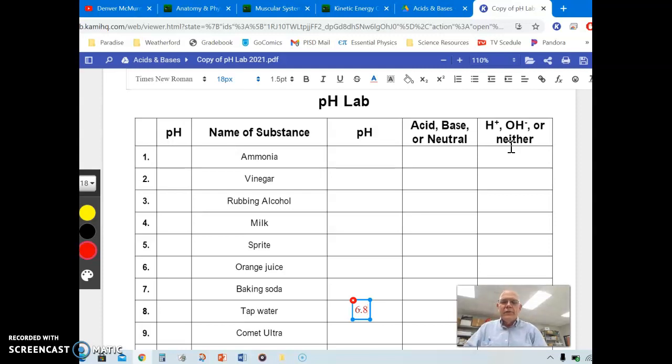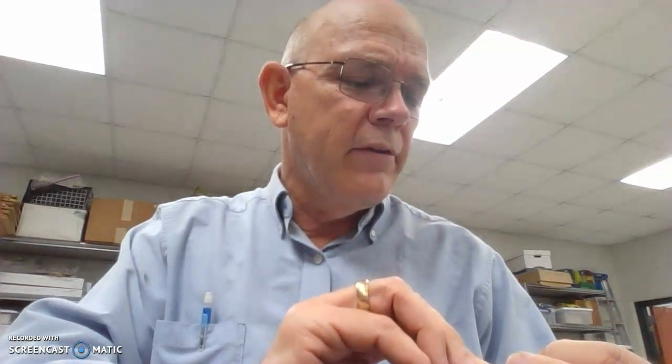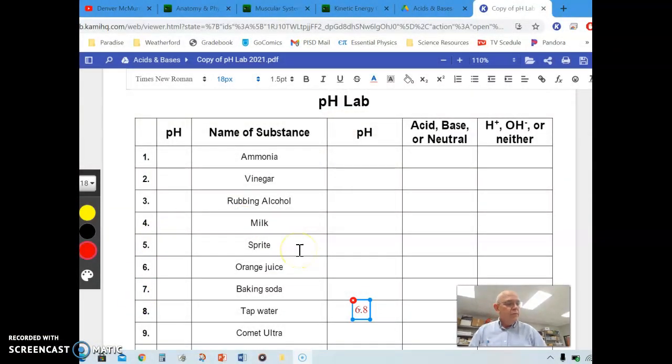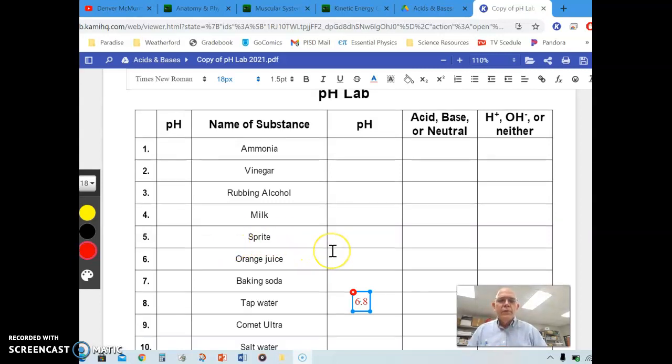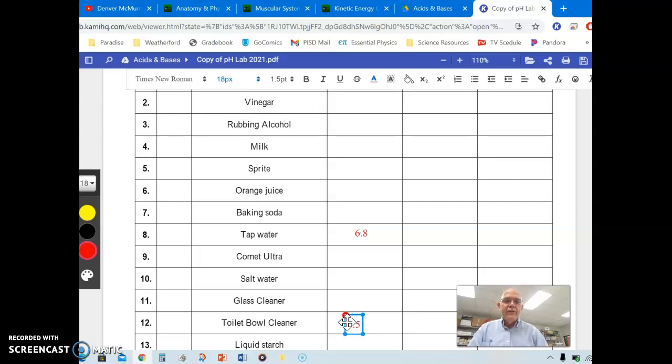I'm putting this one on there, and as you can see, hopefully, let me bring it up to the close-up. It is turning a very reddish color. Red is going to take you toward the low pH, and it's hard to say exactly which one, but I would say it's more like 0, so it's somewhere between 1 and 0. We could put 0.5 for that one, so let's do that. That was number 12, so we'll go down here to 12 and put 0.5. There's that pH.